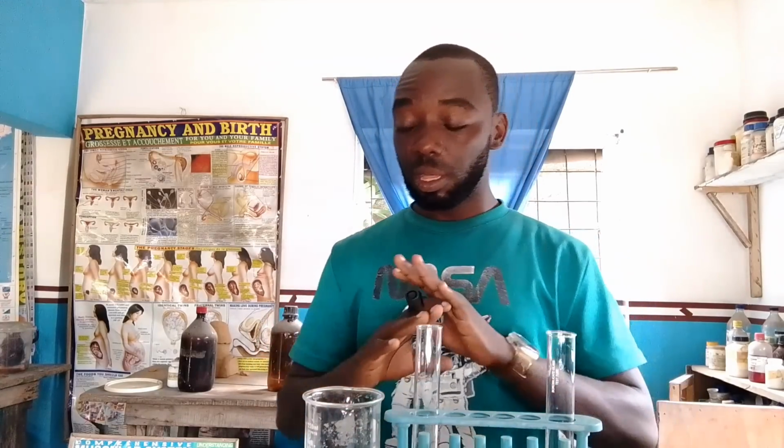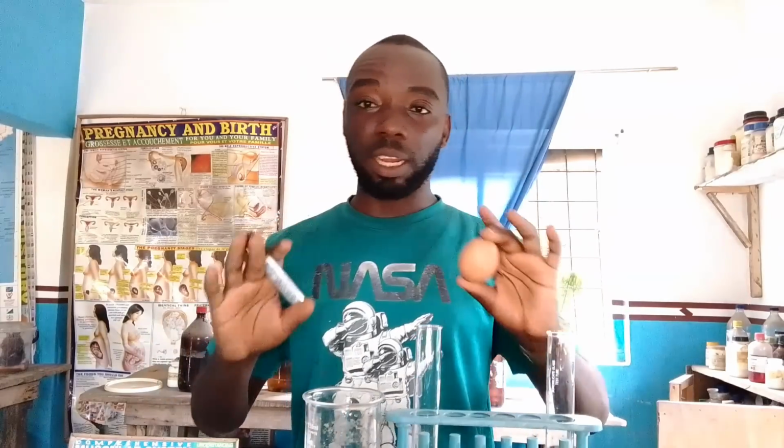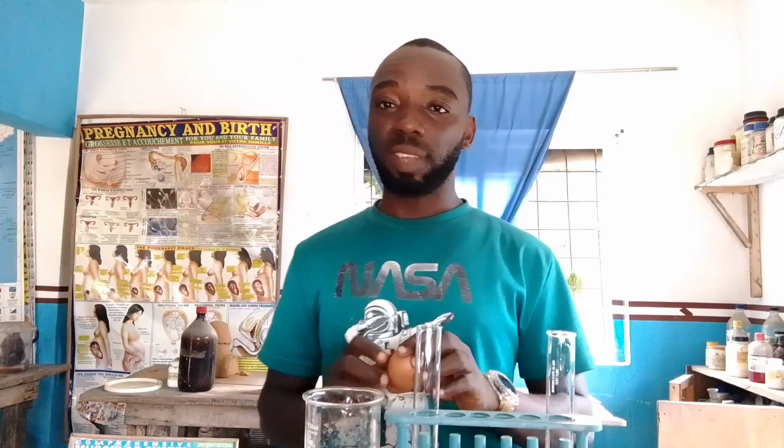Pay attention while I show you how it is done and the result. That is what you should bear in mind. There is no other question they will set for you. They will not ask you to state the function of egg. Rather, it is just the experiment, the test for protein, which we will be doing using the Biuret test.